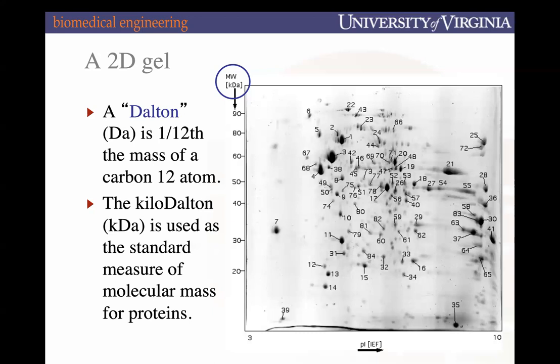Typically, when we load these samples in an SDS-PAGE, when you're just doing separating by mass, there's other ways to try and further bombard them with a negative charge. But SDS is typically like this buffer, and you basically have your gel in this bucket that's completely encased in SDS buffer. And so without having run a 2D gel myself, because I only ever do SDS-PAGE, I suspect that what you're doing is, after you lay it down on top of your page gel, you're basically enabling it to bombard your samples with that negative charge because it's filled with that buffer.